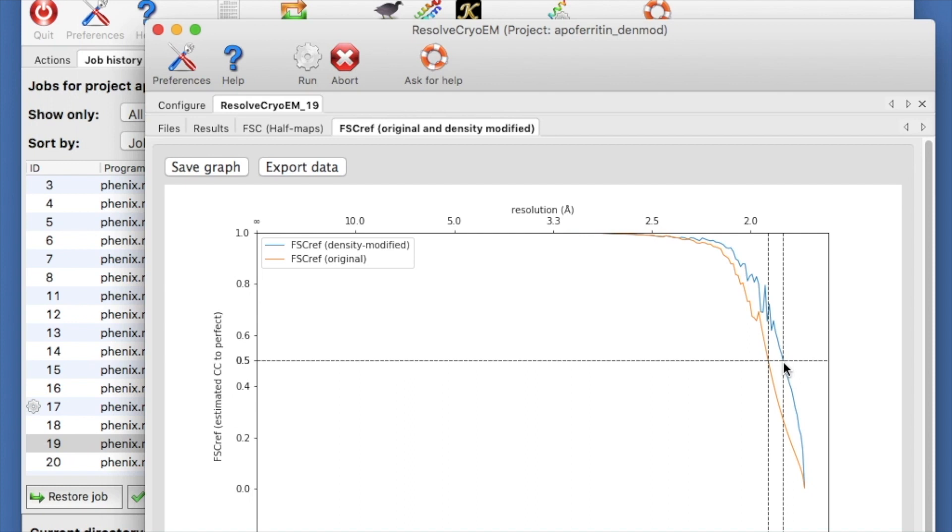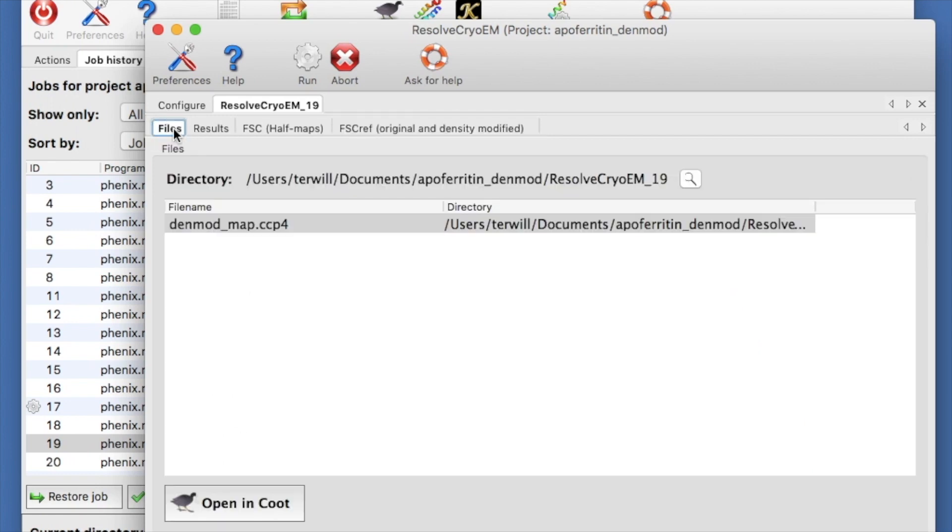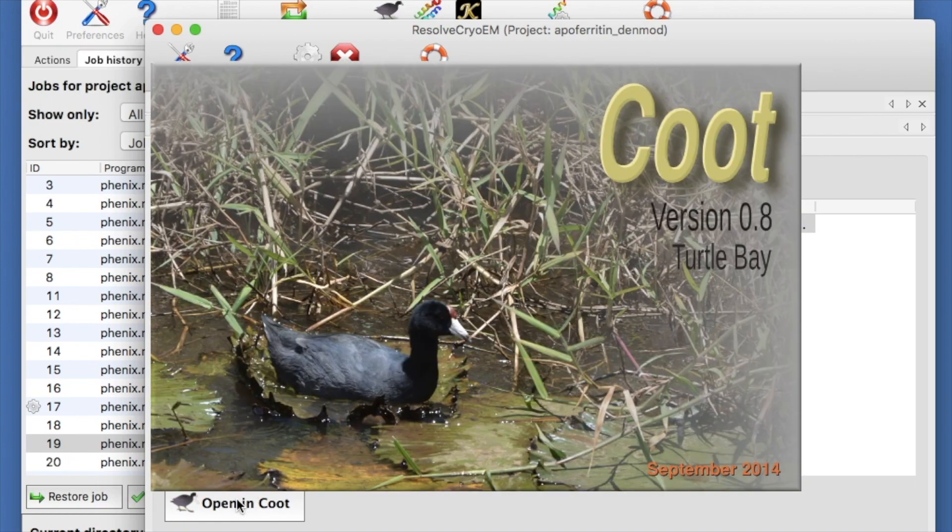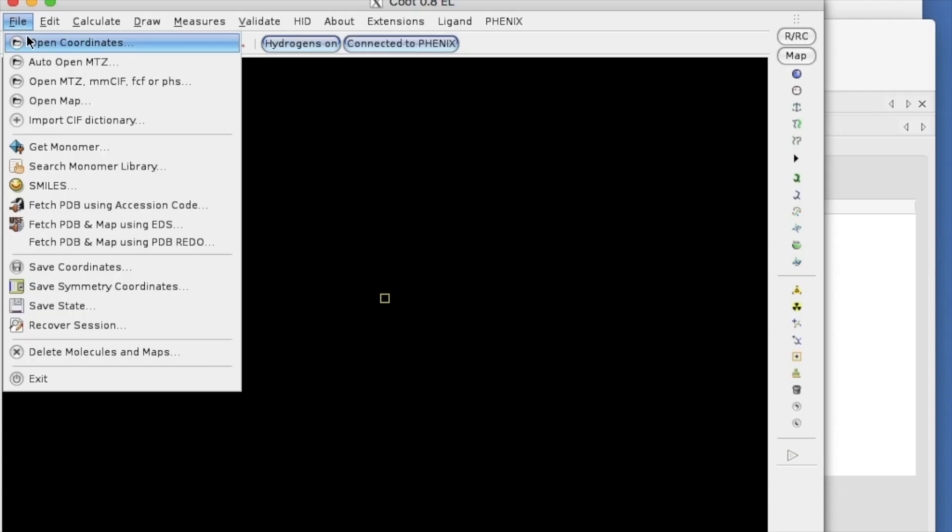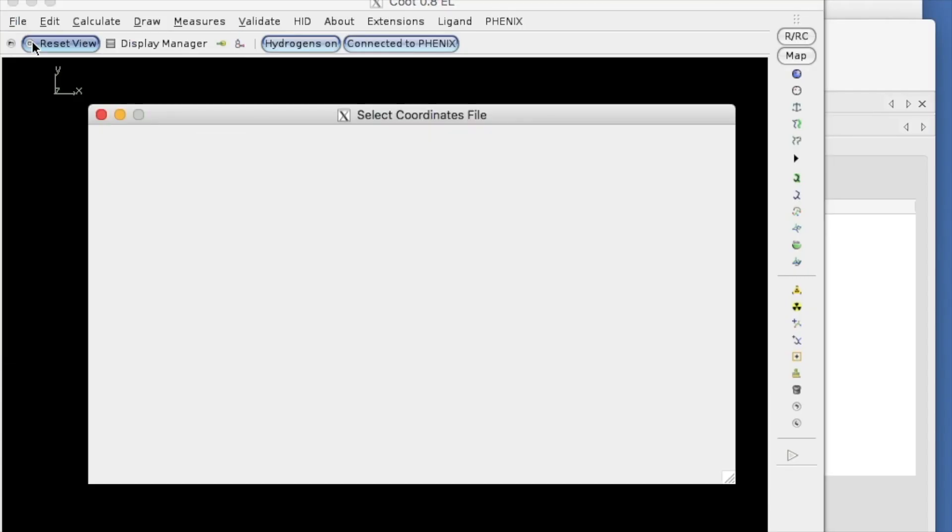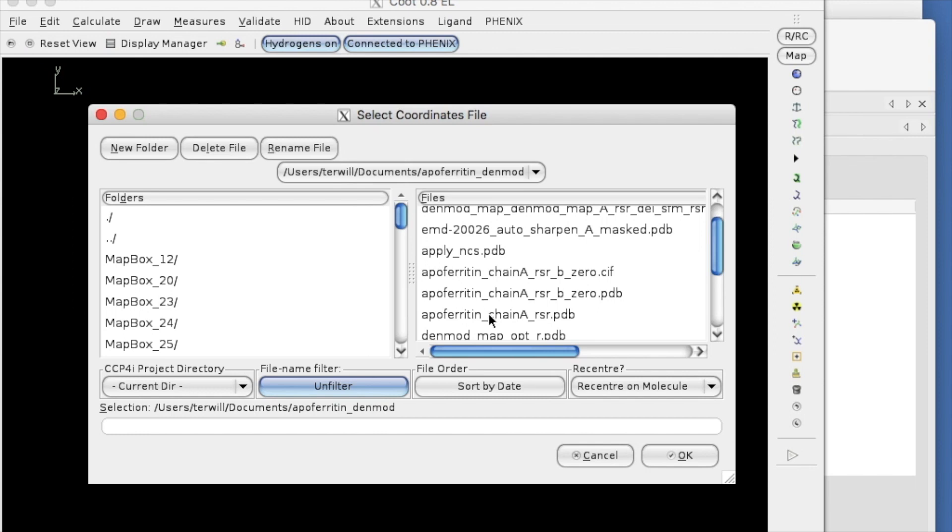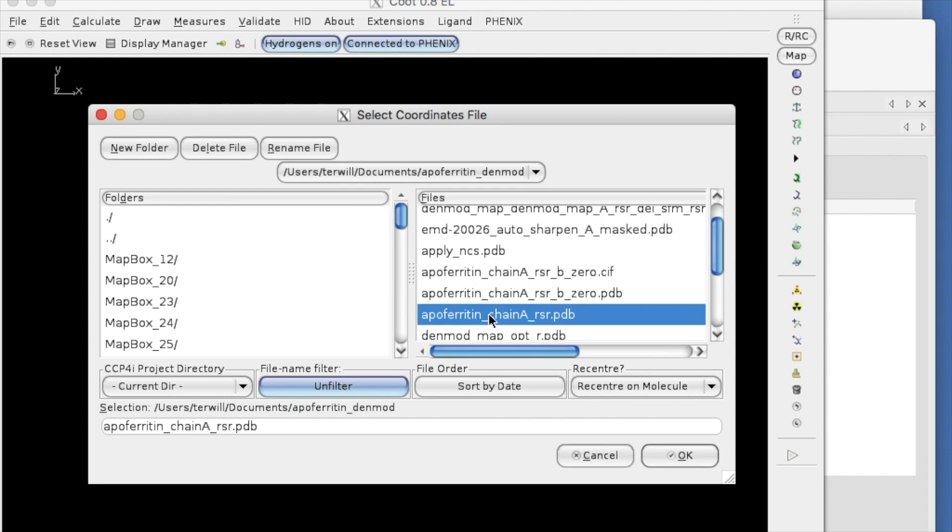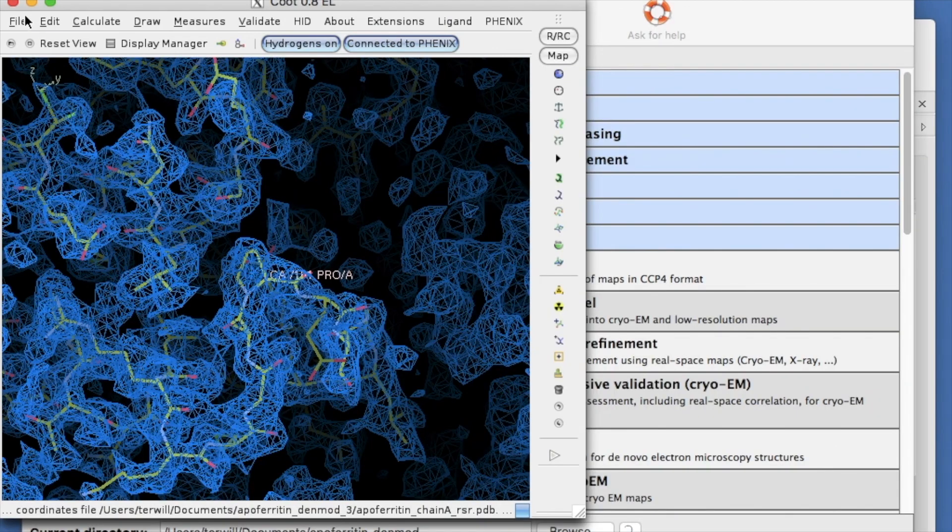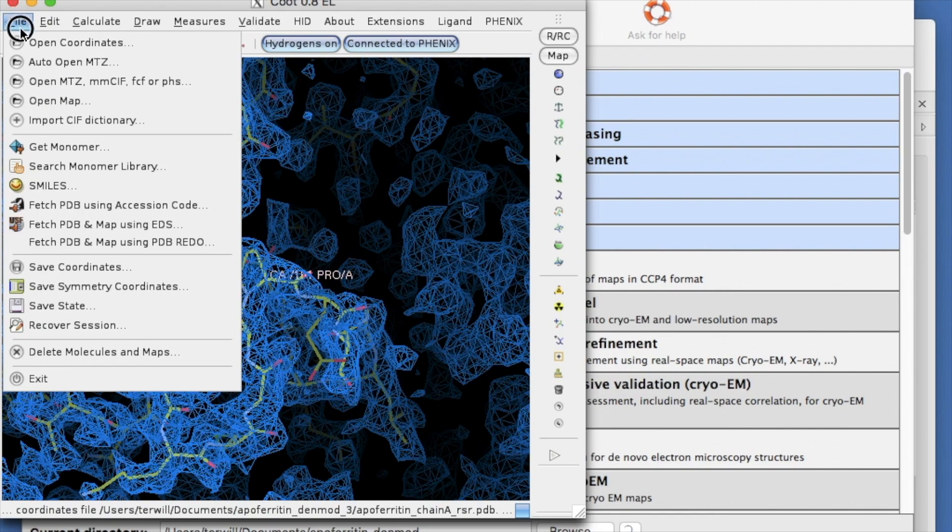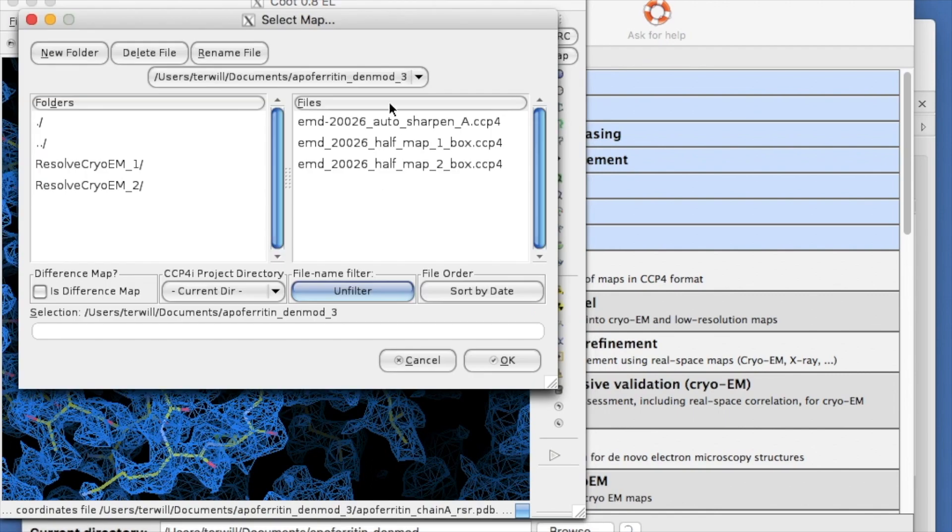Let's look at our original and density modified maps. In the Files tab, select Open in Coot. This opens our map. Let's load in a model from an x-ray structure refined against the original map. This model is supplied with a tutorial and is called apopherritin chain A RSR.pdb. And let's load in that original map that comes with the tutorial.